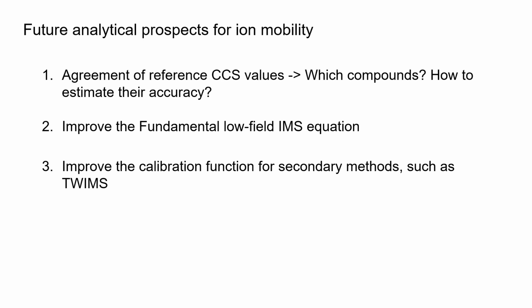We have seen in previous videos that significant steps forward have been made for the traveling wave, and we are in a phase where novel calibration equations will emerge and revolutionize the way we derive CCS on traveling wave ion mobility. In this way, we will really be able to compare the performance of different platforms and technologies in terms of both precision and accuracy.